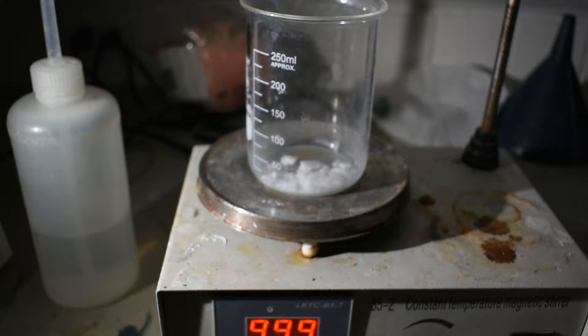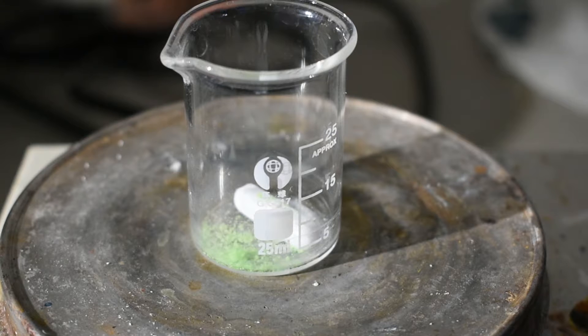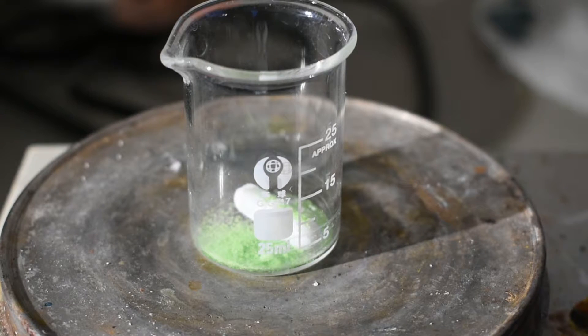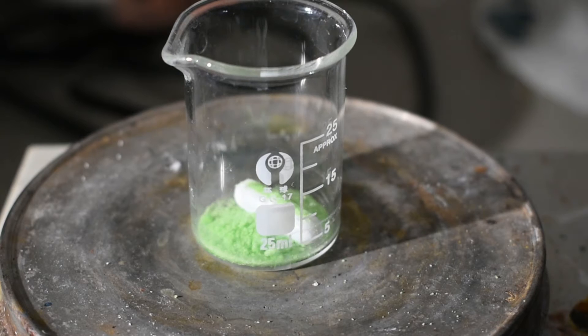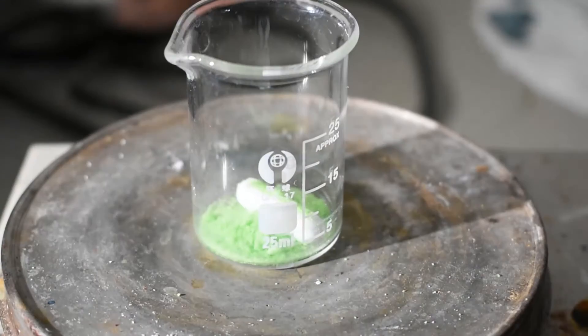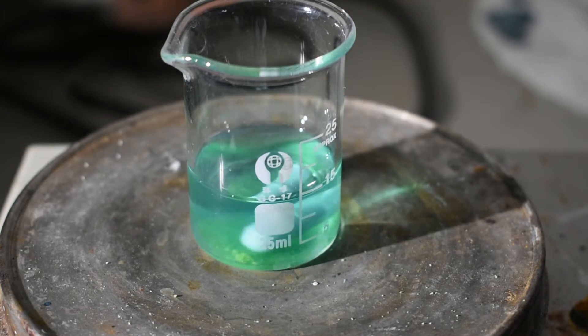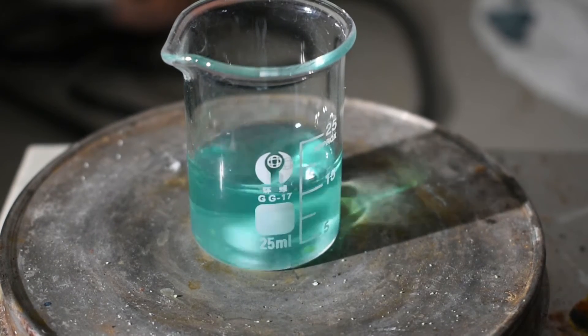So let's get started with the first step, which is dissolving the nickel(II) chloride in some distilled water. I'm just going to add some of the nickel chloride to this 25-milliliter beaker with stir bar. That's probably about enough nickel chloride, and now I'm going to add enough water to dissolve everything. We only need probably about 15 milliliters. It doesn't require much, as it's pretty soluble. And now, it is nearly all dissolved.